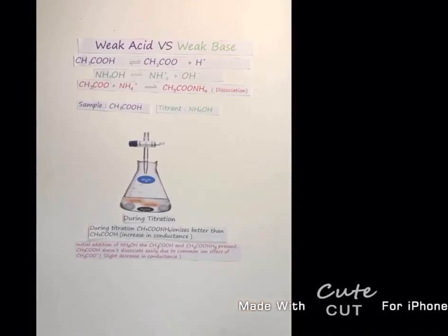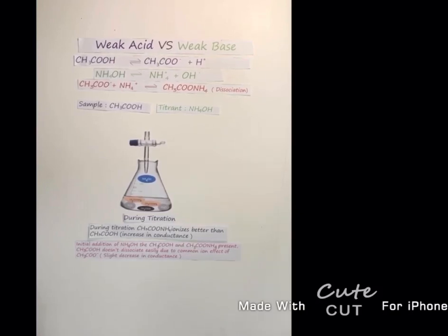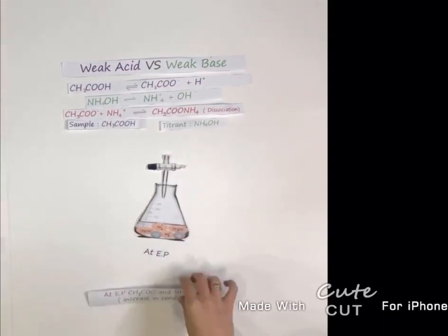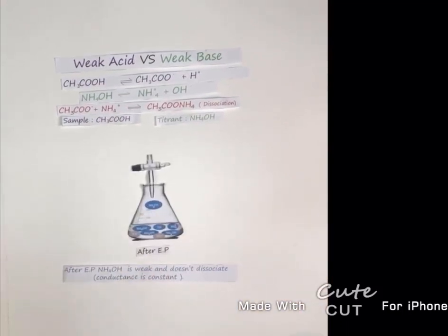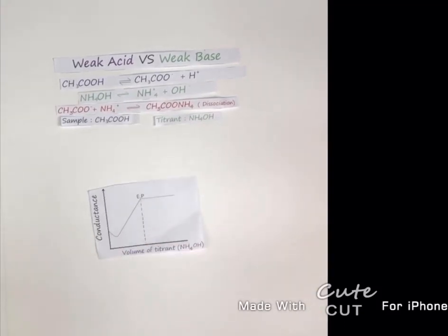With the initial addition of ammonium hydroxide, acetic acid doesn't dissociate easily due to the common ion effect of acetate, giving a slight decrease in conductance. At endpoint, acetate ions and ammonium ions are present, so conductance increases. After endpoint, ammonium hydroxide is weak and doesn't dissociate, so conductance is constant. And this is the curve of the reaction.